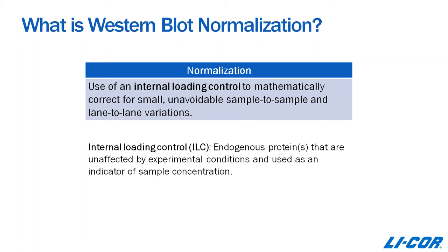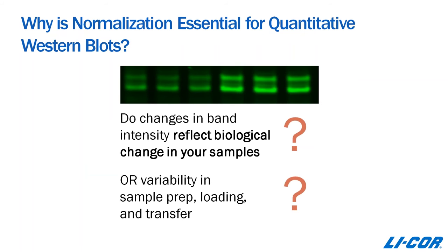From a quantitative Western blot standpoint, when you see changes in band intensity, you really want to know if those changes represent differences in your target protein expression levels, or if they're potentially due to variability in the sample prep, the loading, the transfer, and so on. In this small clip of blot, all of the samples are exactly the same, so the differences in band intensity in the first three lanes aren't due to biological change — they're actually due to errors in loading itself. Normalization allows you to correct for those unavoidable errors that are always going to be part of the Western blotting process.